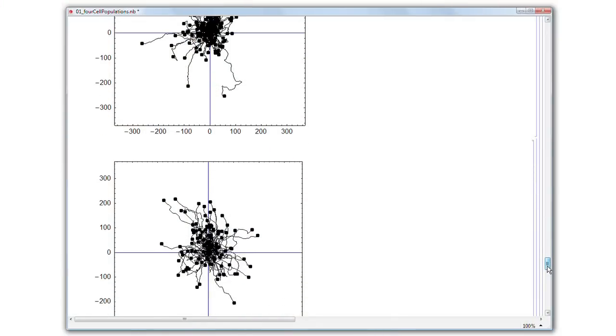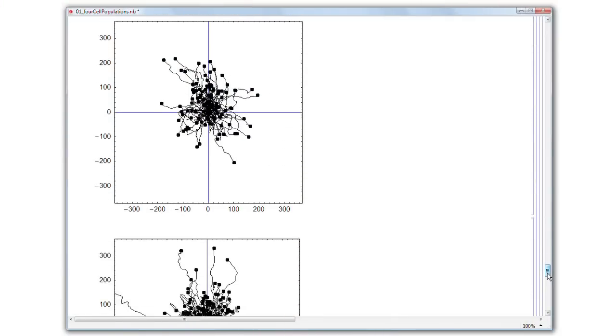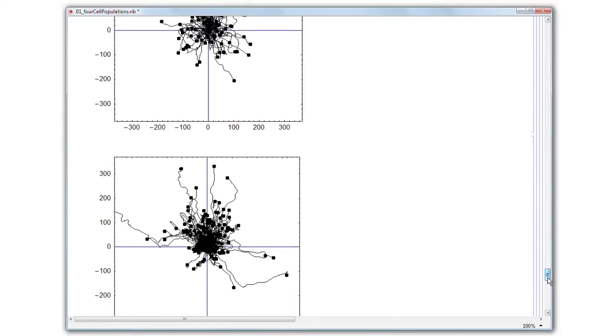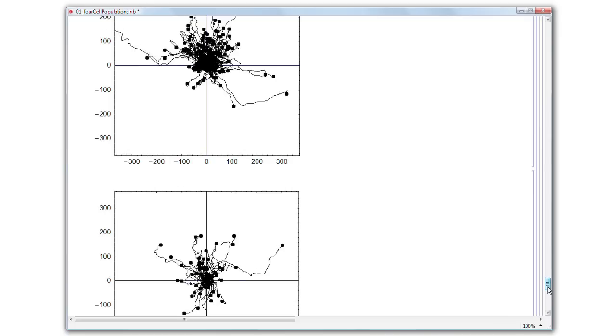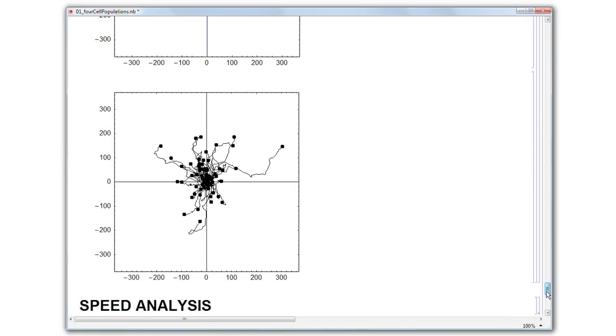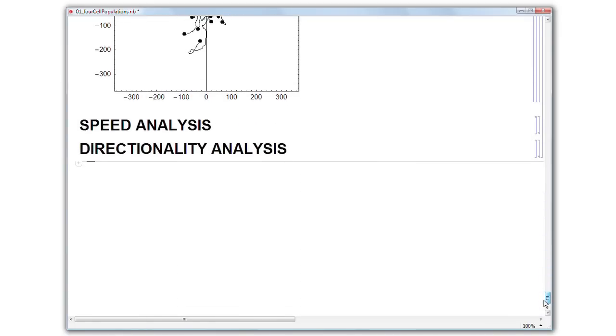Mathematica actually helped us to discover a novel metastasis suppressor. This notebook compares a few sarcoma cell populations — quite a few treatments — but here we just pick four groups.